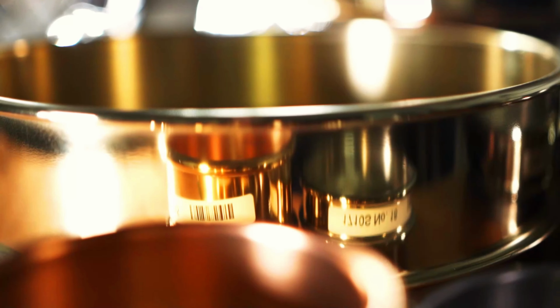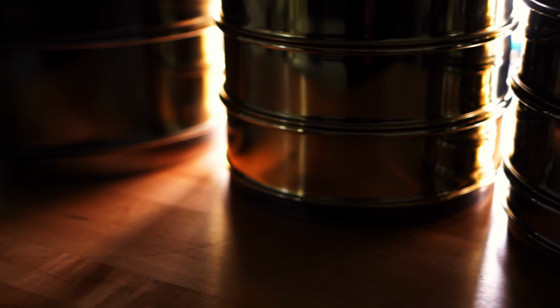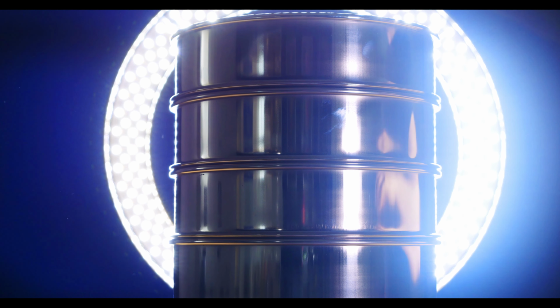Test sieve certification goes hand in hand with these standards. Certification methods can be used to be sure that your sieves are still performing to the level dictated by your standard. Many material testing standards using test sieves will recommend having a master set of certified test sieves that are used as performance checks for the daily working test sieves. The same sample material is tested on the working sieves and the master sieves. Those results are then compared and any variance in results is addressed. This can help you to determine any wear on the daily use sieves and replace any worn as necessary.